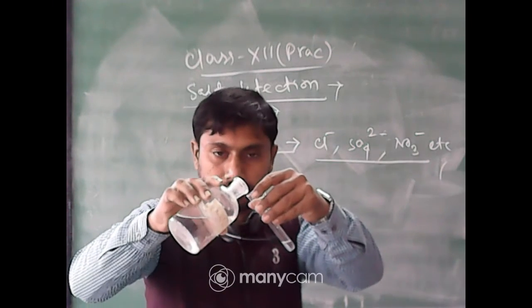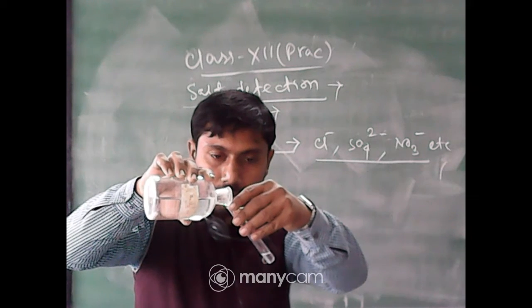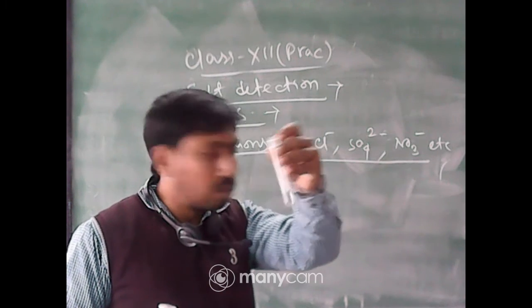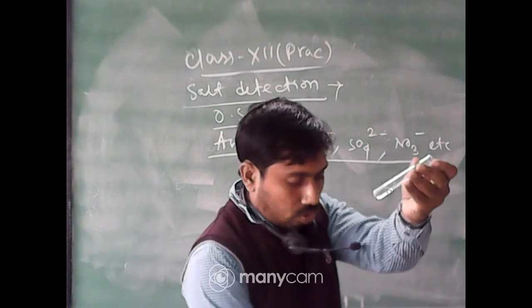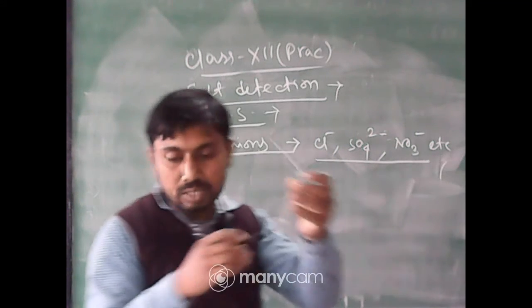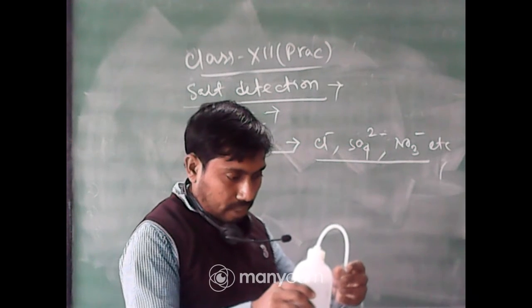Now adding barium chloride solution to the original solution. No PPT was found. The solution remains transparent here also. So from there, no conclusions will be drawn. The two experiments, the test for halide and the test for sulphate, were rejected. There are no conclusions from that side.